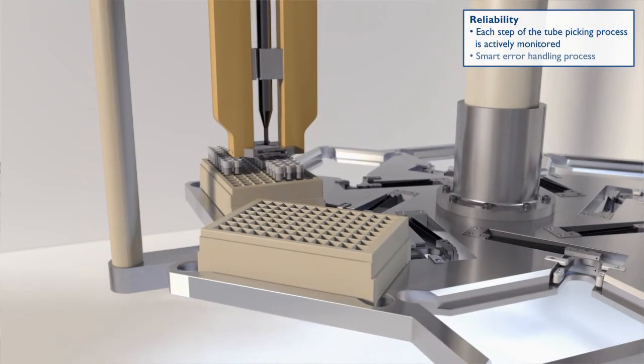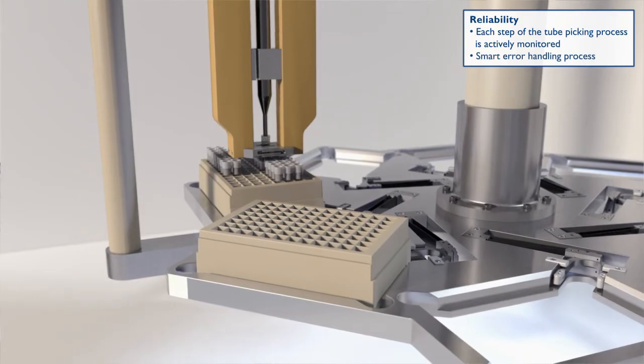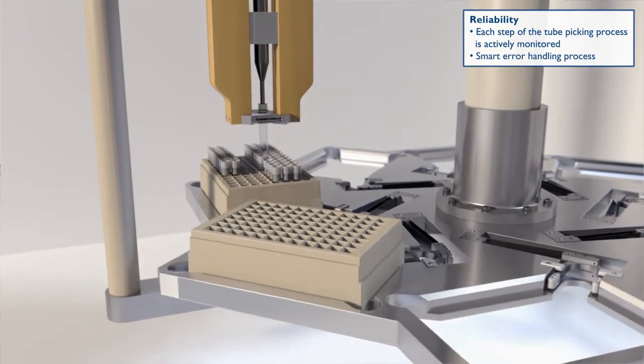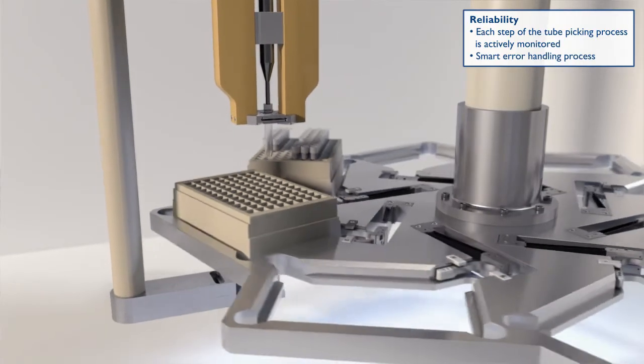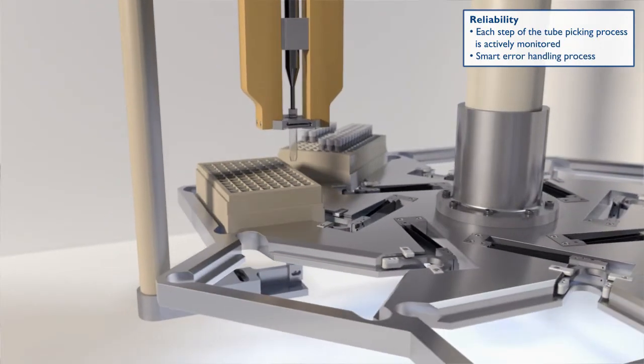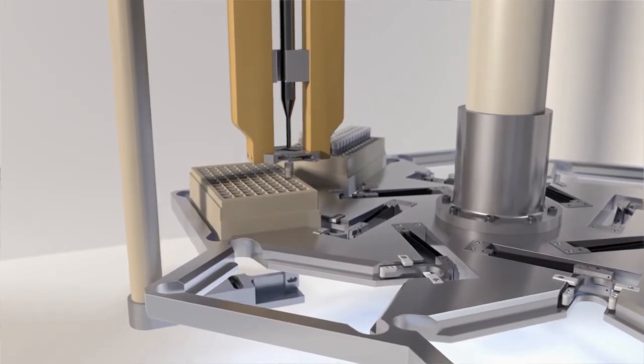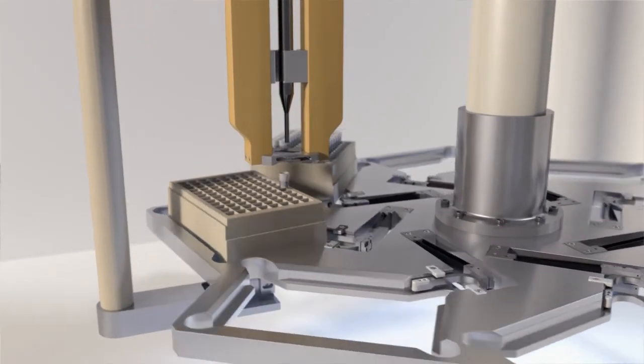In addition, each step of picking is actively monitored to maximize reliability and provide smart error handling processes.